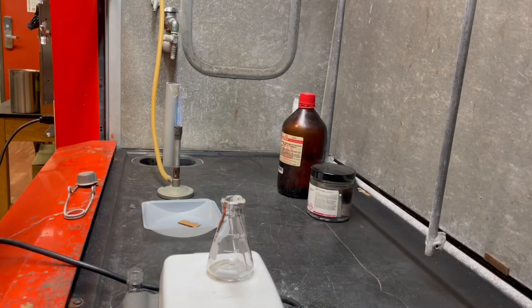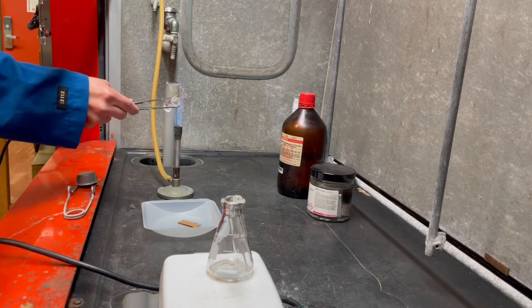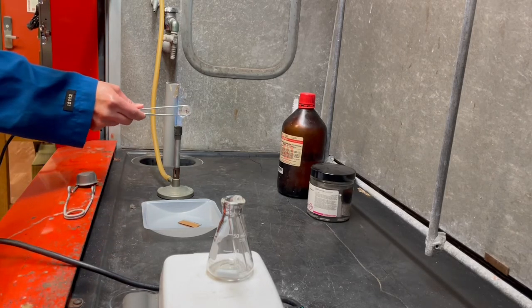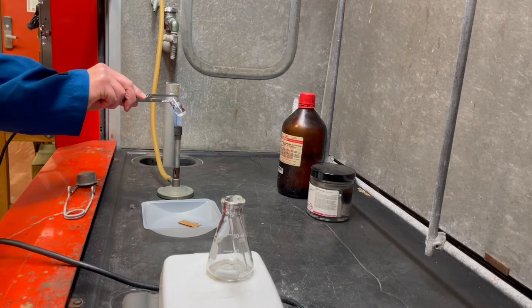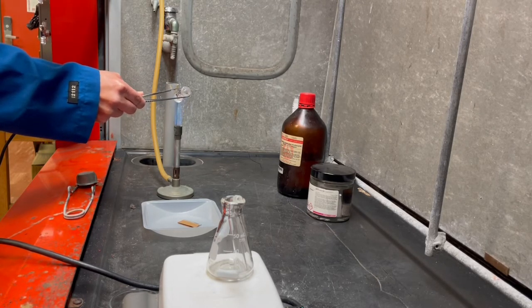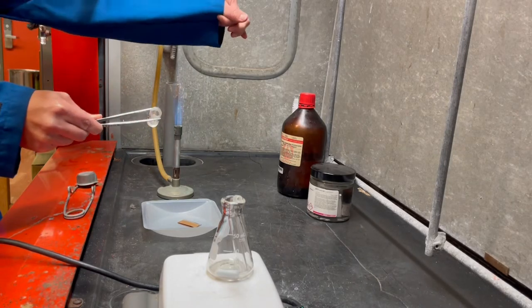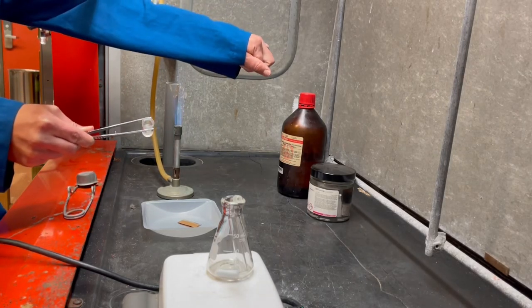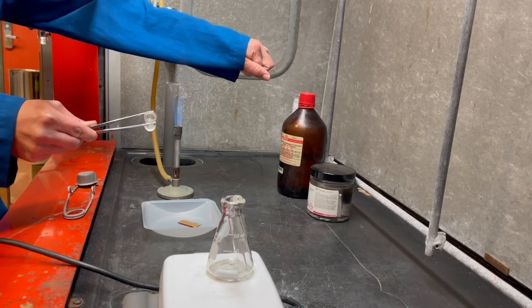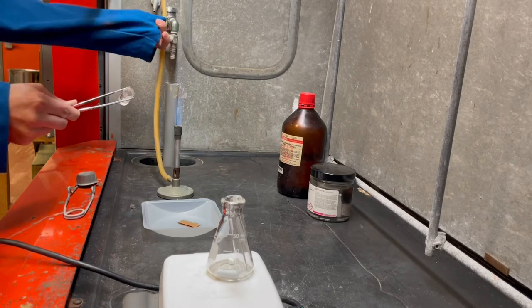All right, so in order to keep as much of the water in the atmosphere or on the glassware out of our reaction, we could put it in the oven, which I did actually do with some of this glassware, but I was being a little impatient. I figured I might as well hit it with some fire, just like my lab coat. So you can see my lab coat didn't light on fire or anything.